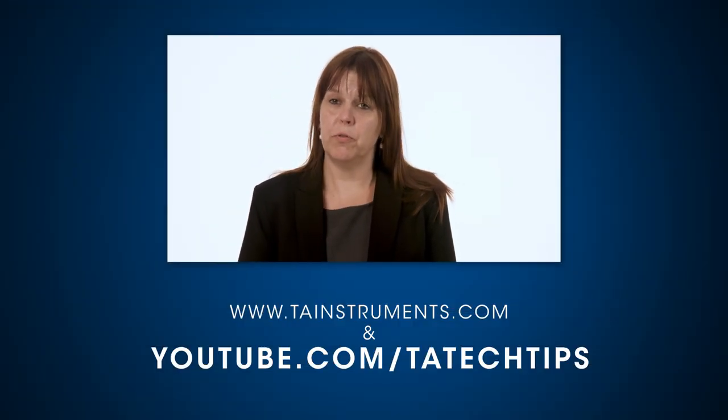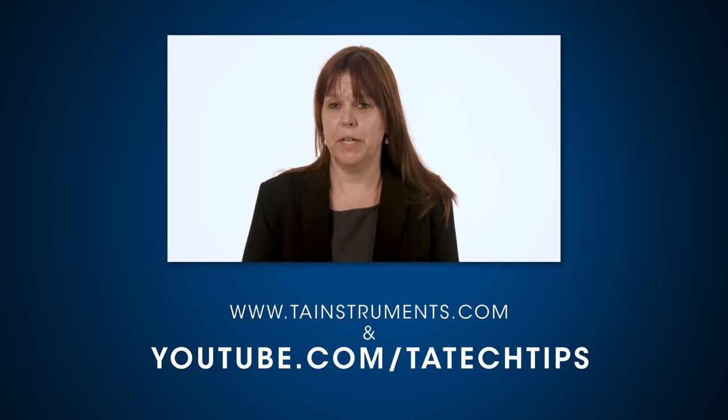In this tech tip we discussed how to configure the SolCal. Please stay tuned for more helpful tips from TA Instruments, and thank you for your interest.